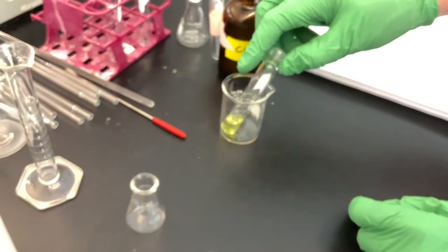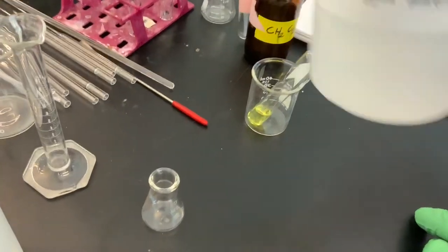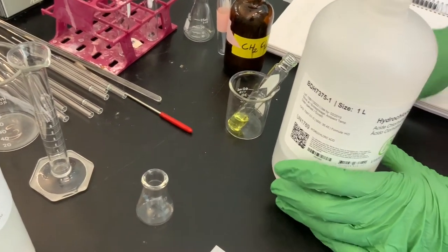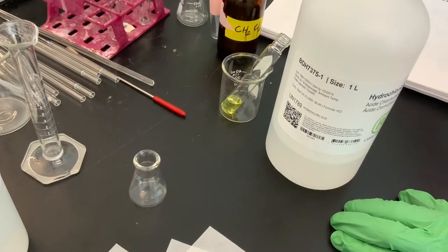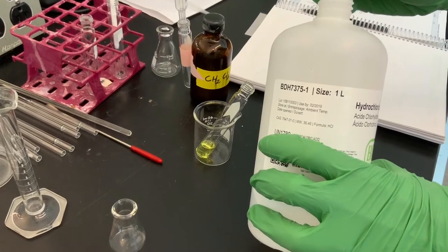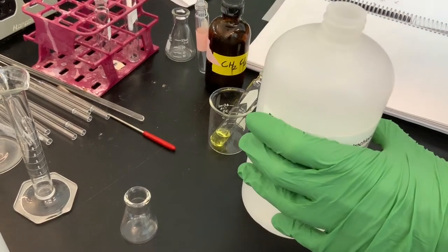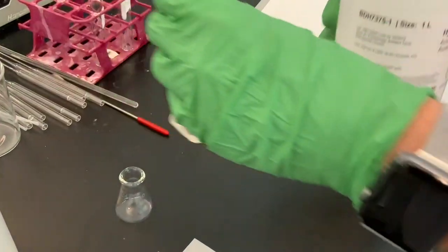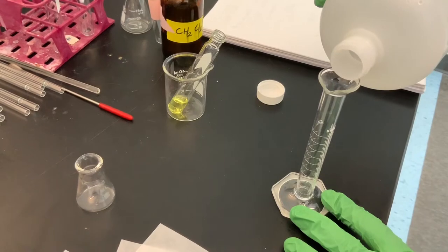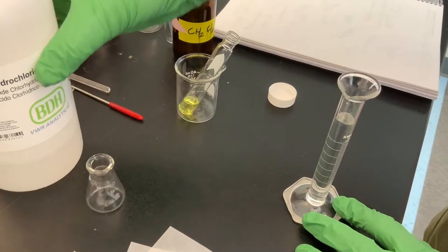To this, we are now going to add 3 molar hydrochloric acid. So here I've got hydrochloric acid, and we are going to add 2 milliliters of this, and we're going to do so twice to extract the benzocaine out as that benzocaine salt. And we're going to extract it away from the organic layer. My pipette doesn't fit down in there, so I'm going to add the HCl to a graduated cylinder. It doesn't have to be perfect. I just want to be able to reach it with my pipette and not have to dive too far down in that bottle.